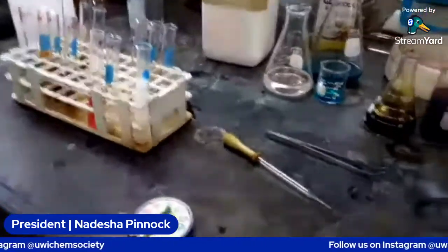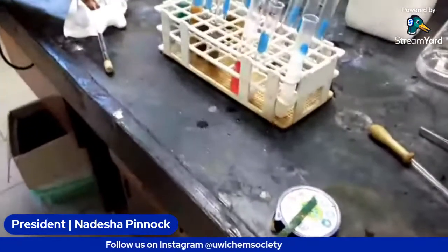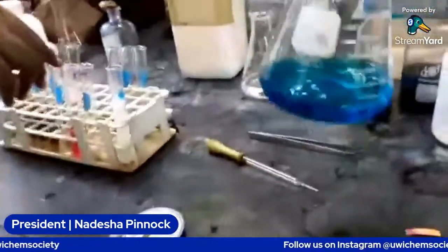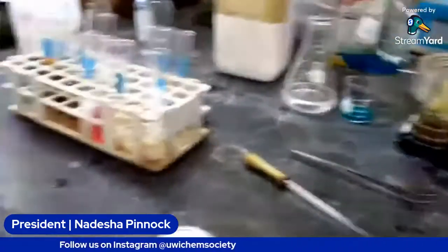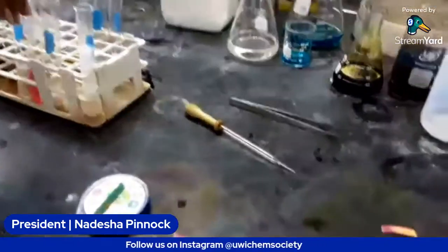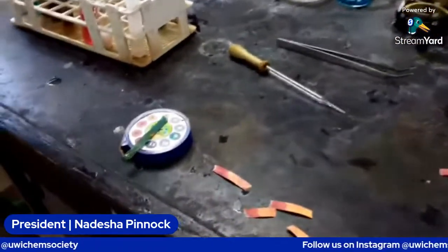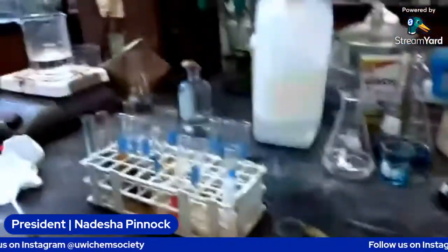For our reducing and non-reducing sugar test, which is still ongoing, we use Benedict's reagent, which is copper sulfate with trisodium citrate and sodium carbonate, which for this experiment I substituted with sodium bicarbonate.